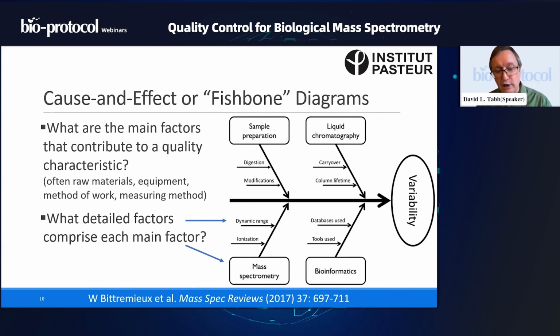So you should have a very clear question that animates the creation of this fishbone diagram. In this case, what is causing the results of our shotgun proteomes to vary in the proteins that they observe and the, let us say, rank ordering based on intensity, something like that. Okay, so being able to understand that complex causes lead to a combined effect is an important factor that we just have to take into account. The more complex the process, the more doors are open for variability to enter.